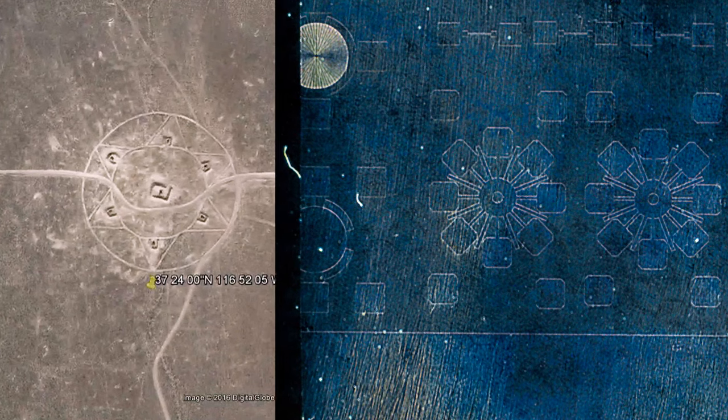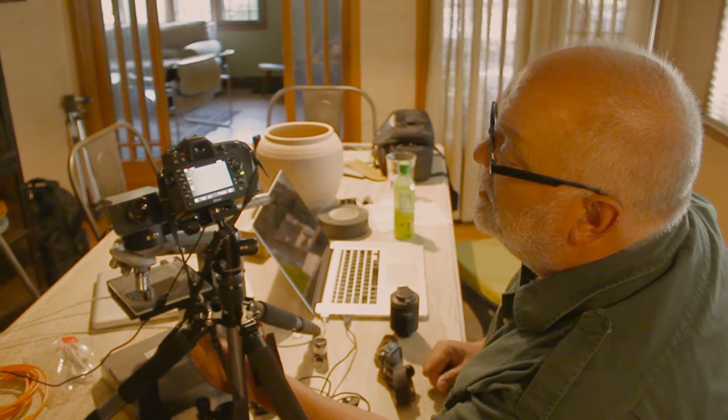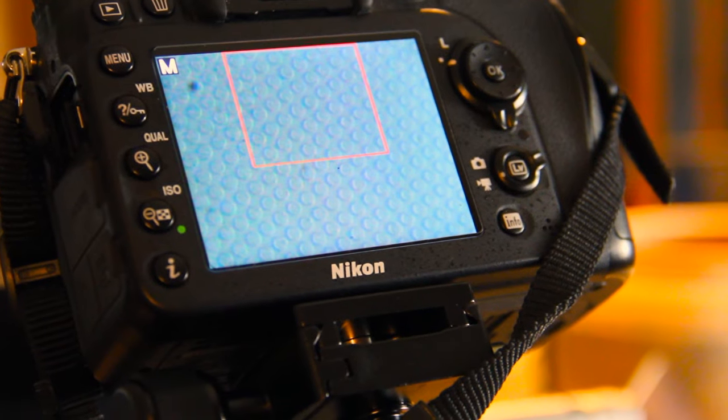So they'd go into the desert and draw lines in the ground to let their pilots practice? Yeah, that's super cool. Those look like circles.